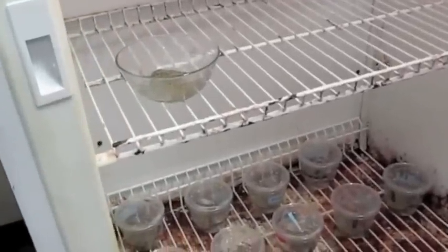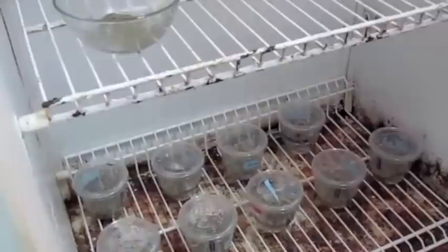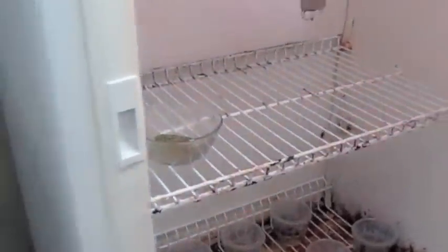We have two replicates of the experiment. Every three to four days, I will take the cups out and go over to the microscope and open three of the capsules in each treatment to see if the larvae are still alive.